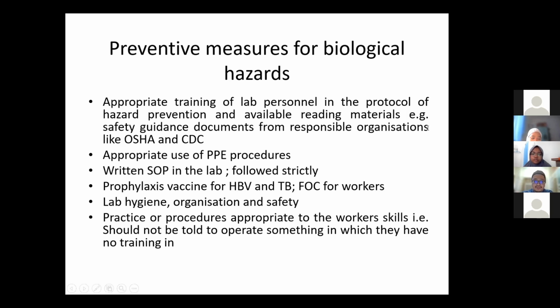Preventive measures also include lab hygiene, being organized and being safe. Workers should not be told to operate something in which they have no training.